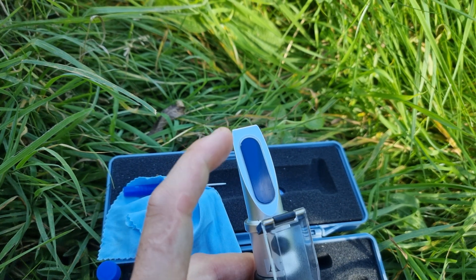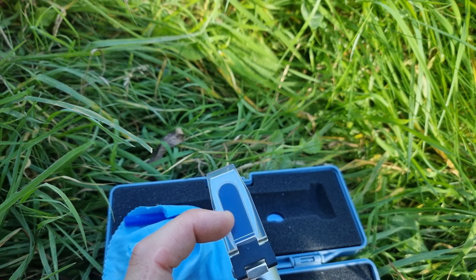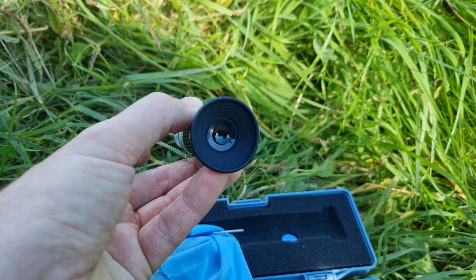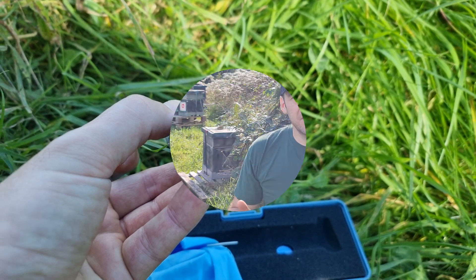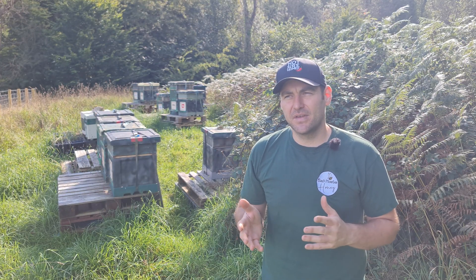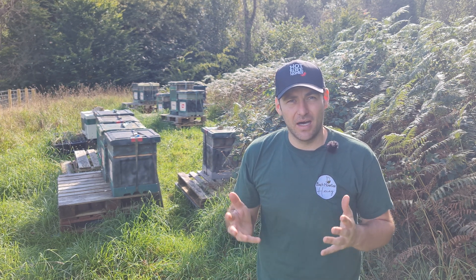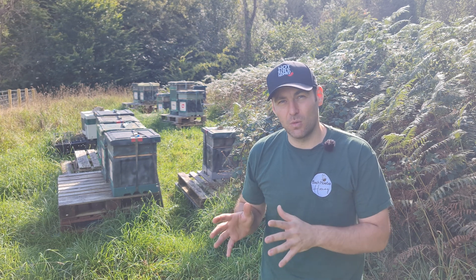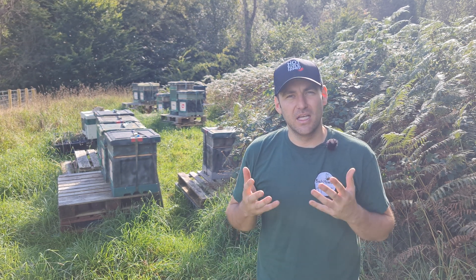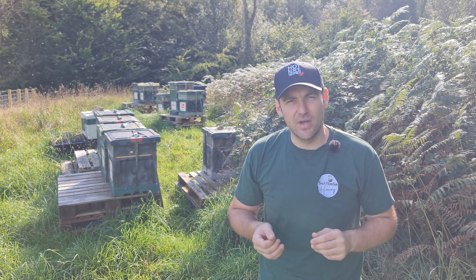Just to run over that again: you get your honey, smear it on there, close it down until it covers all of the gauge with honey — don't leave any gaps — then hold it up to the light and it gives you a really simple reading. The refractometer refracts the light going through whatever you put in it. You're targeting under 20%, which is what it legally needs to be to be called honey. But a safer percentage to go for is below 18%; between 17% and 18% is a really, really good guide.